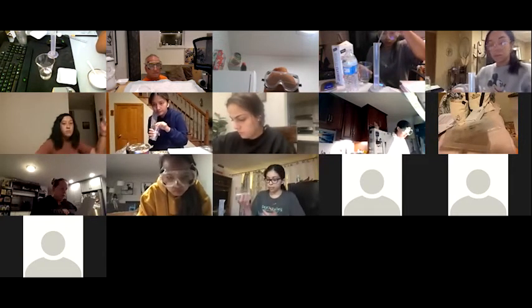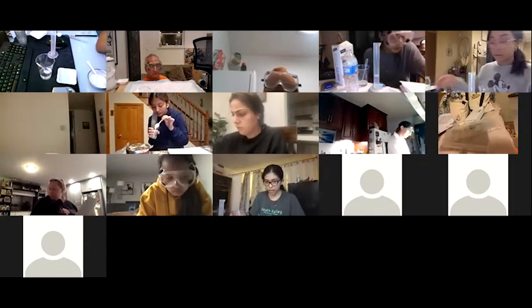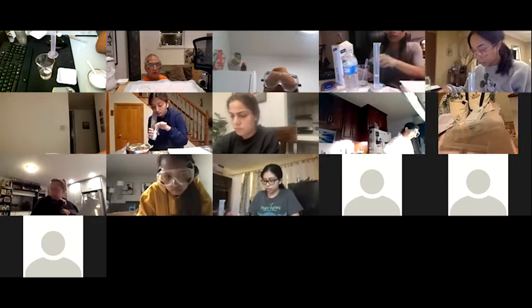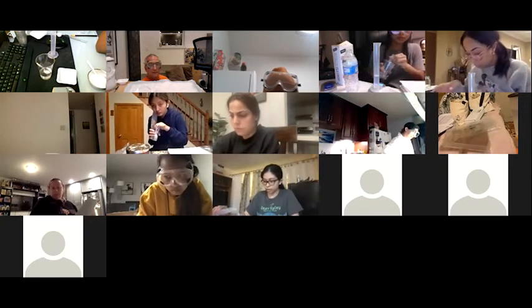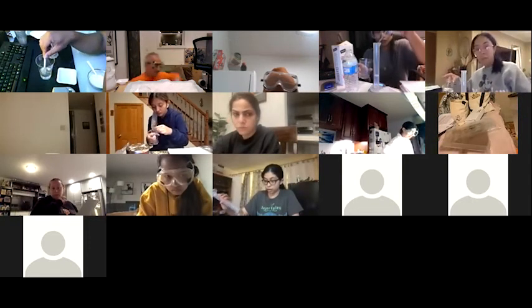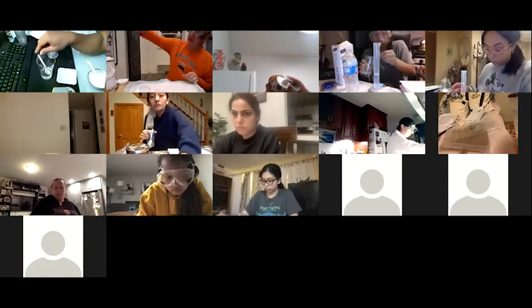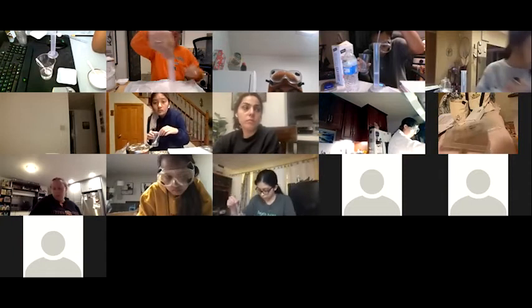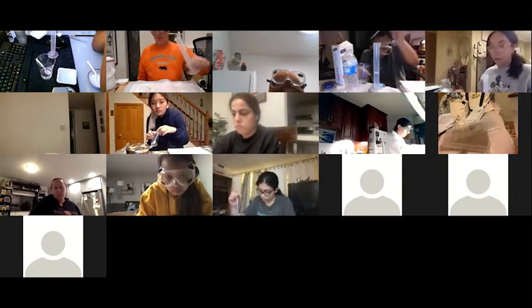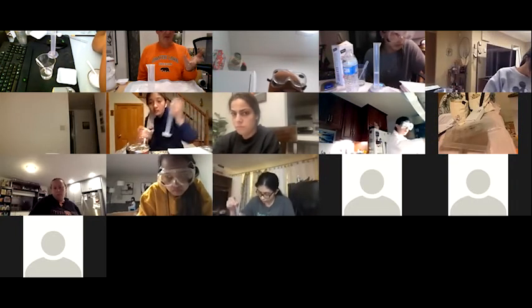So I just put this on the scale and then tare it, correct? Yes, it reads 0, and now add 50 grams of water. The way you do that is you measure 50 mils of water, approximately, in your cylinder. You add that to the cup. That should be approximately 50 grams.